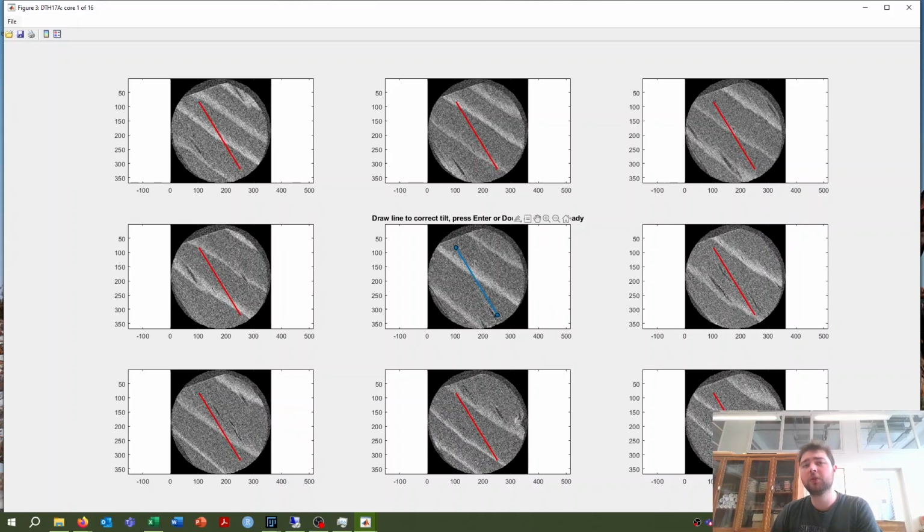It's not critical that this is super exact, and very often in dried cores or for example tropical species, the fiber direction will change throughout the core. That's why later in RingIndicator, when we indicate the rings, we will indicate it in 3D anyway. So this step being super exact doesn't really matter that much, but it's better to do it as good as possible.